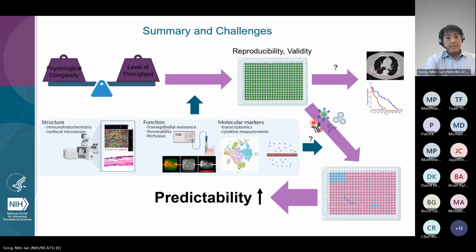So we have been optimizing the tissue complexity in a high throughput platform depending on the context of use, and then complementing it with cutting edge technology to validate the tissue models from the molecular level to the tissue level. So the application of these fully validated 3D models to high throughput assay development brings challenges in both technical development and clinical relevance.